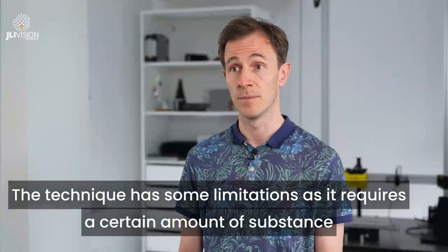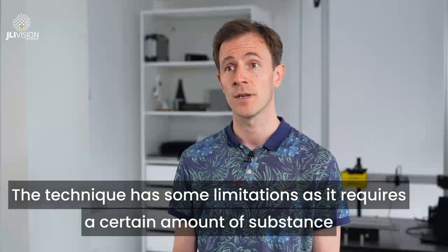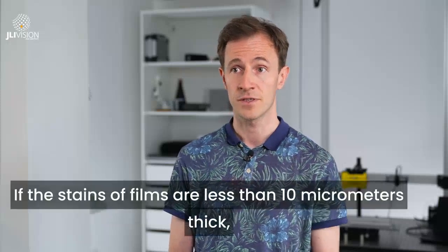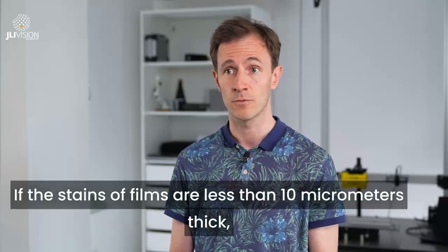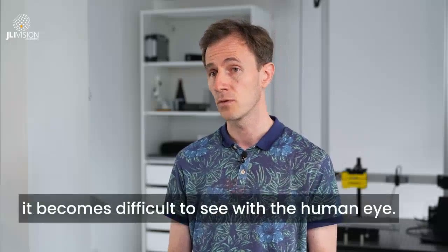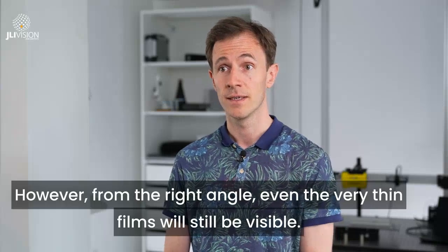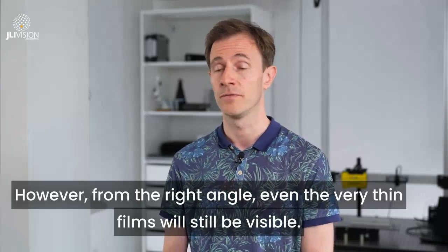The technique has some limitations as it requires a certain amount of substance to create the fluorescent effect. If the stains or films are less than 10 micrometers thick, it becomes difficult to see with the human eye. However, from the right angle, even the very thin films will still be visible.